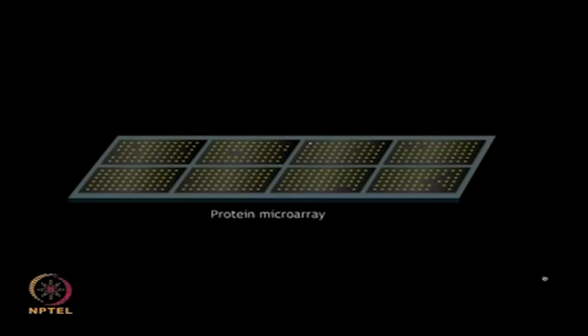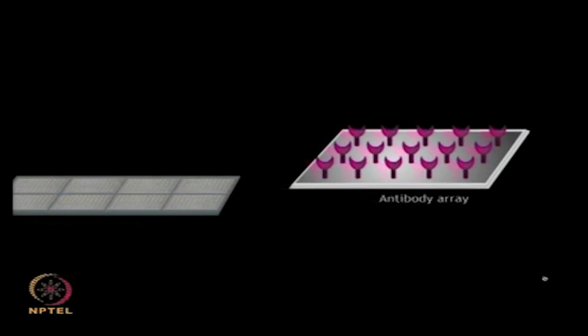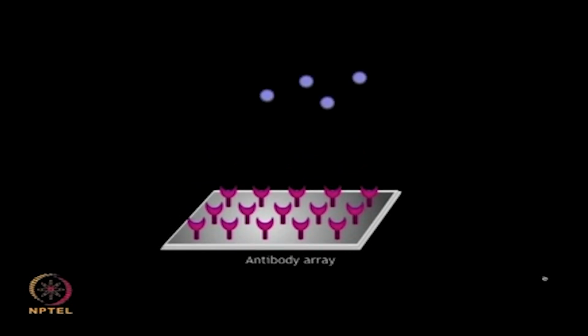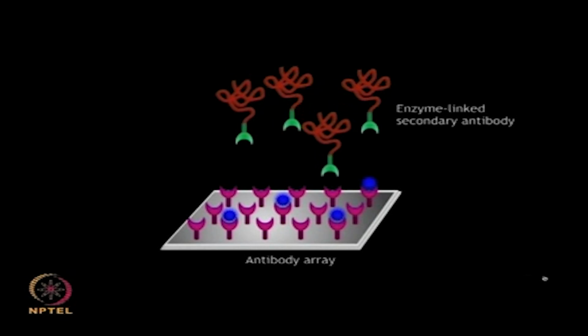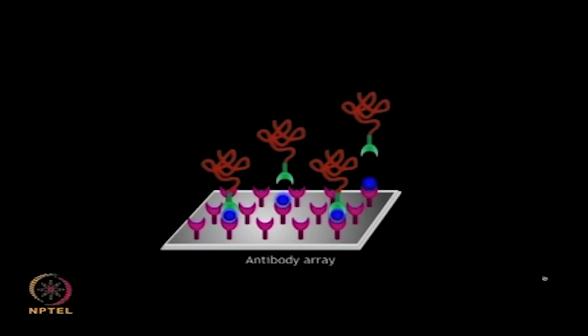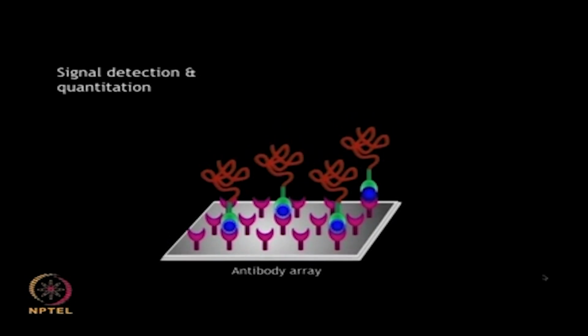Chromogenic detection. The antigen antibody binding interaction can easily be detected by means of chromogenic reactions. An enzyme that can give a colored reaction upon addition of suitable substrate molecules is linked to the secondary antibody. This acts as a probe by binding to a different epitope on the same antigen from that of the primary antibody bound to the array surface.